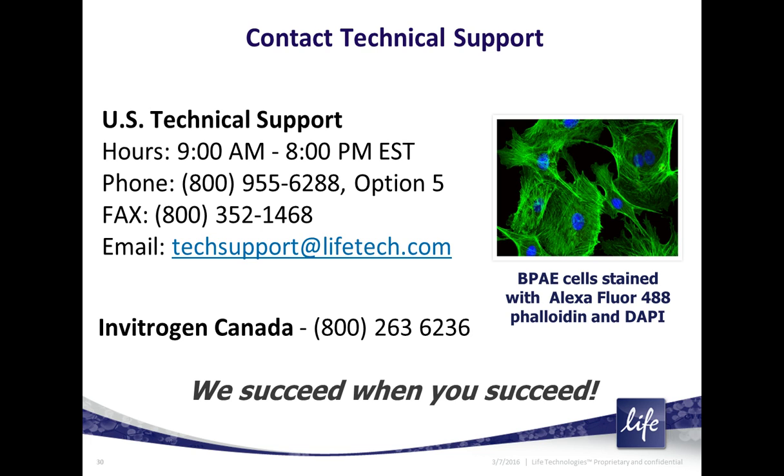If your mountant cures or hardens, it can slow the spread of those reactive components. And if you have a free radical scavenger or antioxidant in there, it will mop up those free radicals or singlet oxygen and prevent it from hurting other dyes.